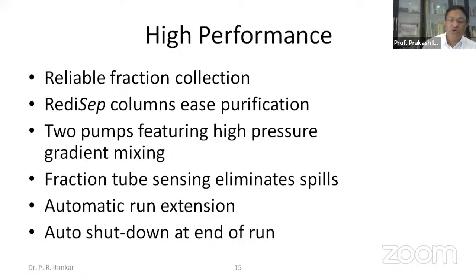So if you have any question in mind, like can we use the same column subsequently? No. Once you handle one particular sample and use that particular column for separation, after the complete process is over, that column cannot be repeatedly used. This is a kind of disposable column system which the company has prepared.